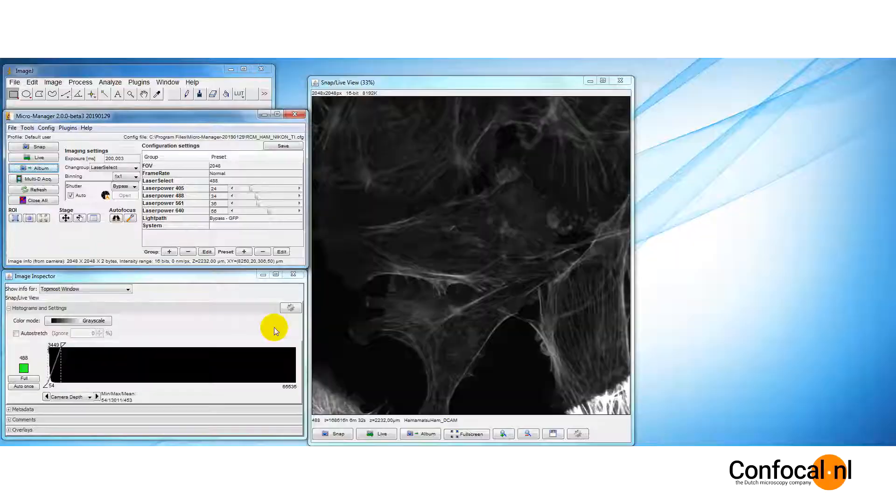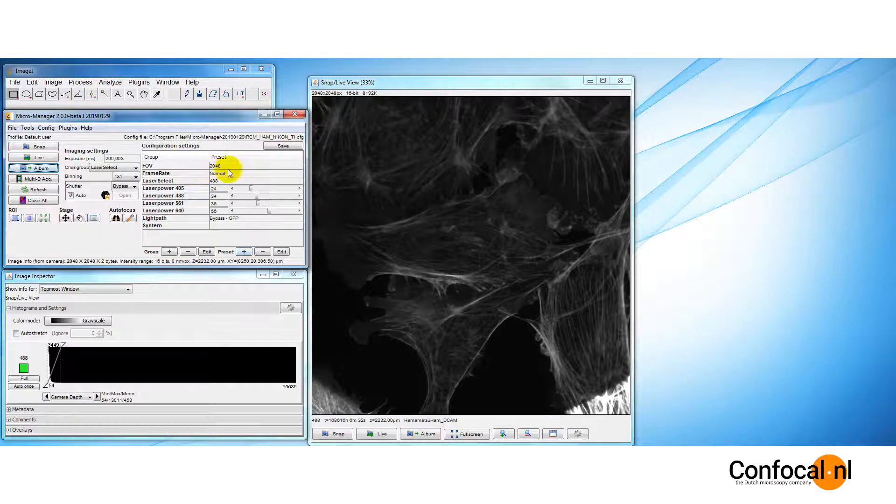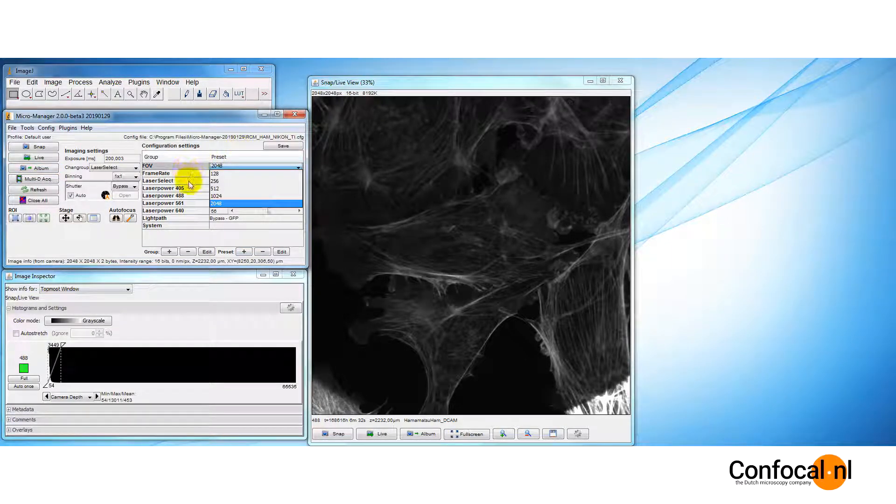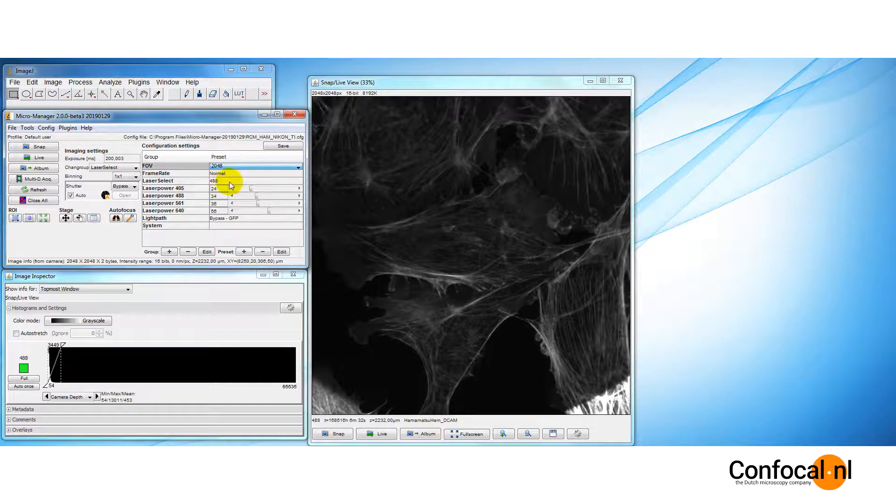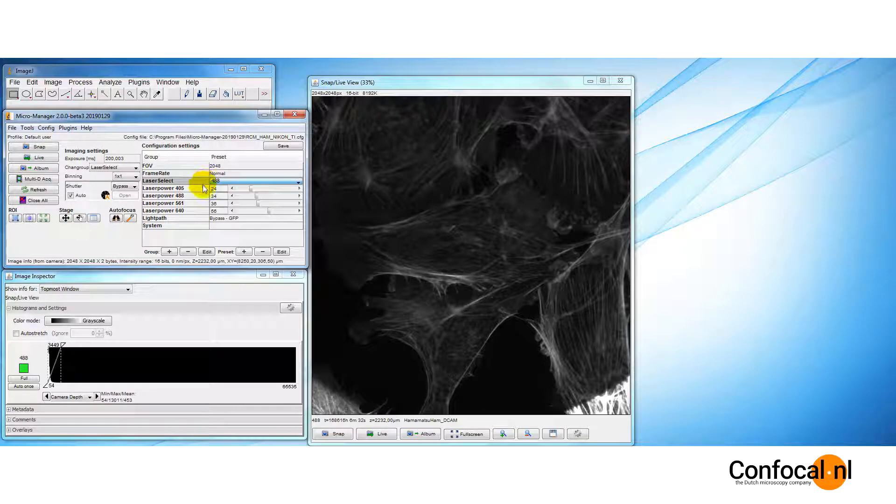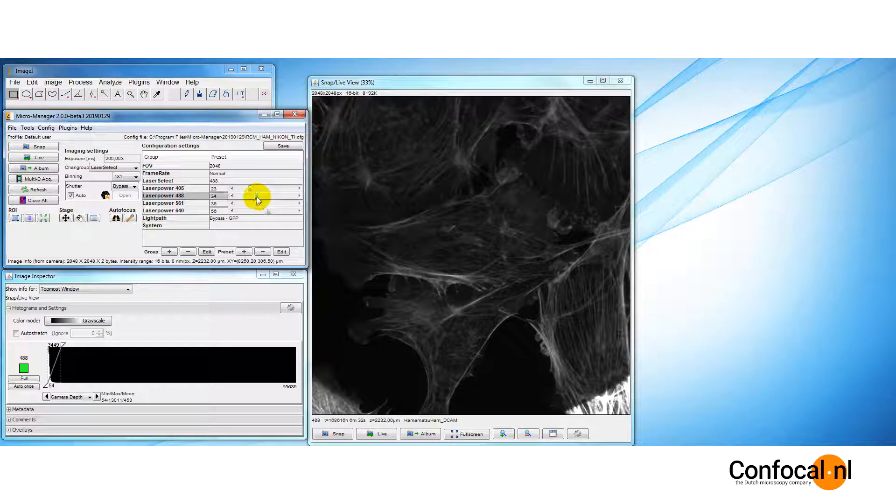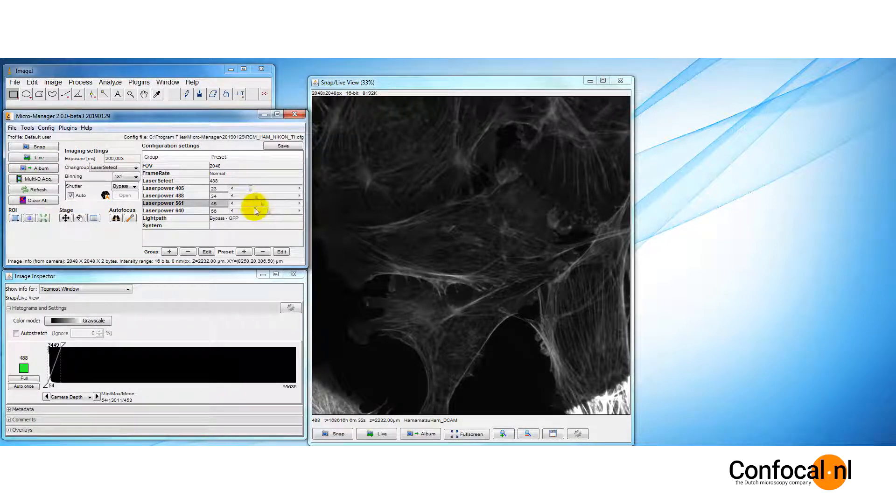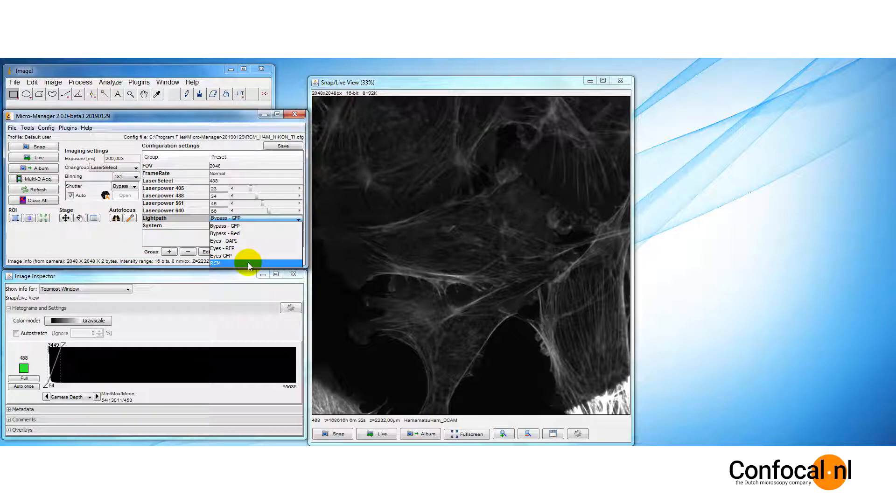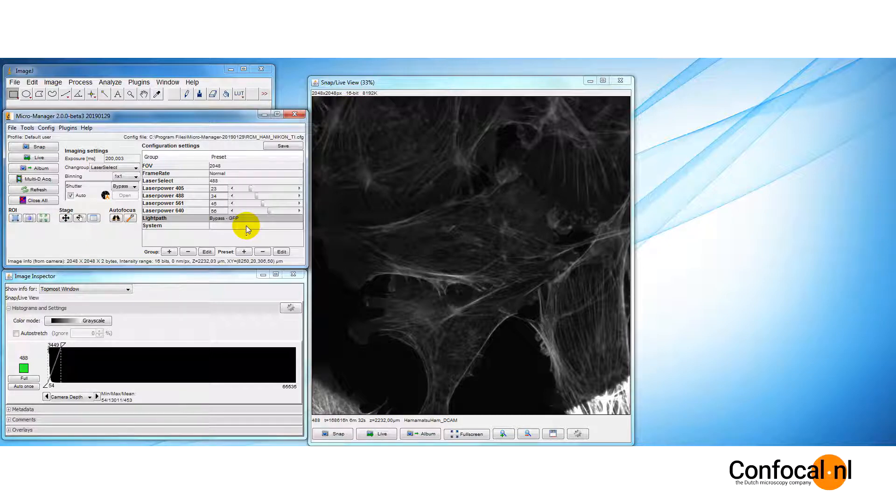On the right, we have the RCM unit controls. Field of view or FOV to set the area scanned. The pixel size is independent of the scanned area. Laser select to change excitation wavelengths. Laser powers to modulate the laser powers for each channel. Light path to switch between the three modes: IPs with channels, bypass mode with channels and RCM. System to initialize the settings of the RCM. The GUI that is shown is completely customizable.